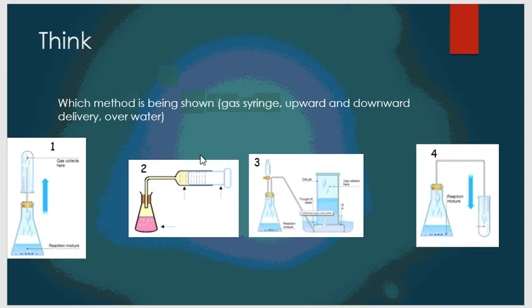Okay, so for each of these pictures, I want you to think about which method is being shown. So is it the gas syringe, upward, downward, or over water? So I'll give you 30 seconds or so. You can pause the video to think about that.